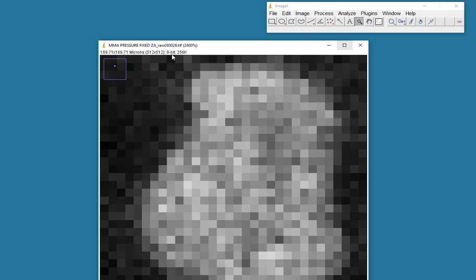Now this is an 8-bit image as you can see here. And in an 8-bit image, that means that each pixel has a value that ranges between 0 and 255. So 1 to 255 plus the 0, which counts as a value, gives us 256 possible values for each pixel.